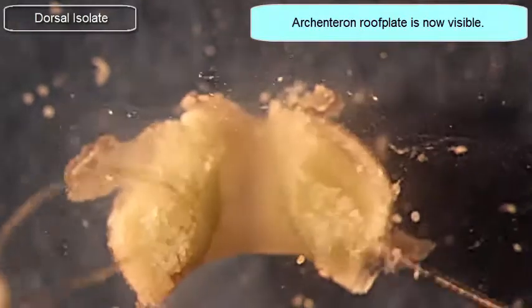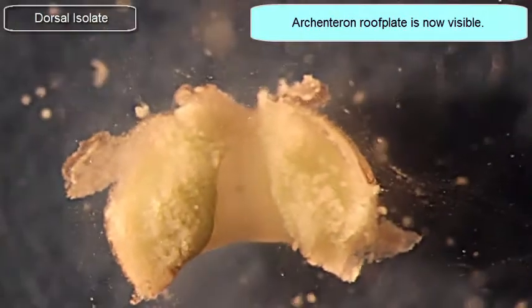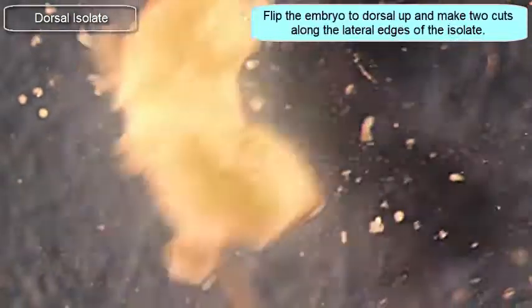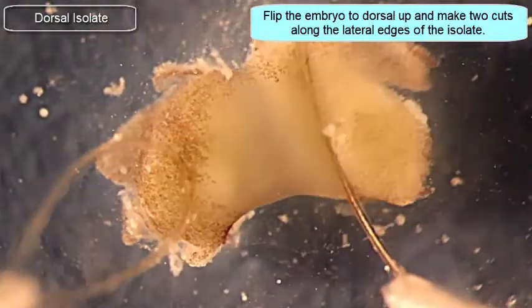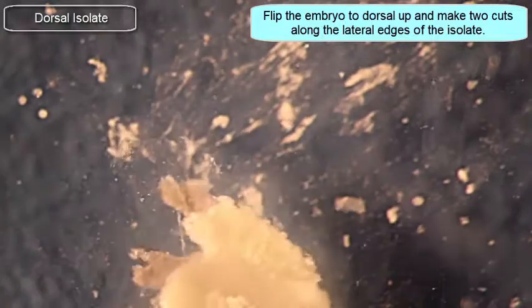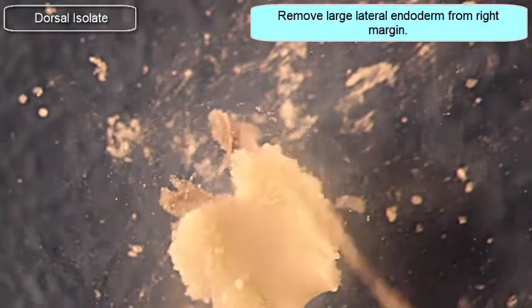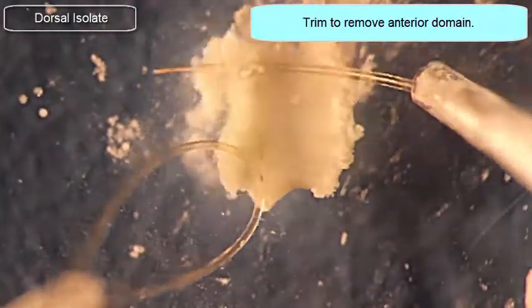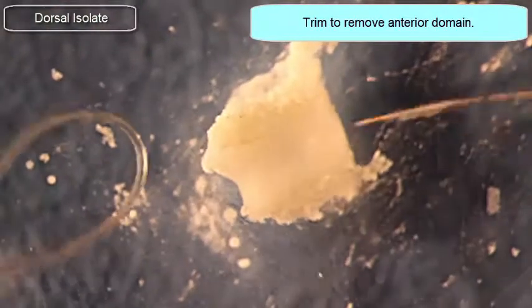There you see it — the entire floor of the archenteron is laid out right in front of you. At this point, I'm going to flip the embryo around and trim off the left and right sides from the dorsal perspective. Note that there are still large vegetal endoderm cells — or lateral endoderm cells — on that explant.